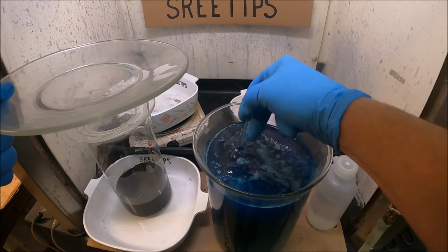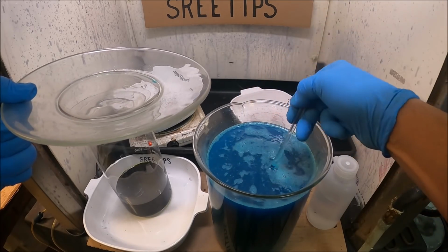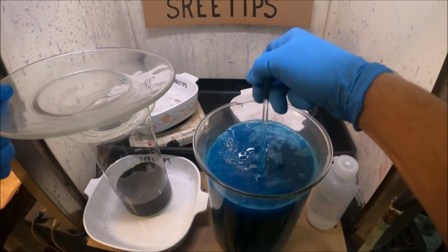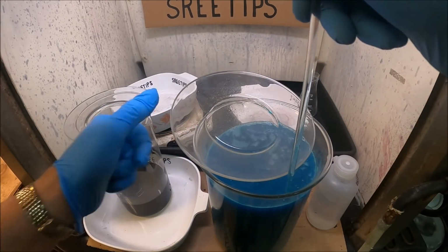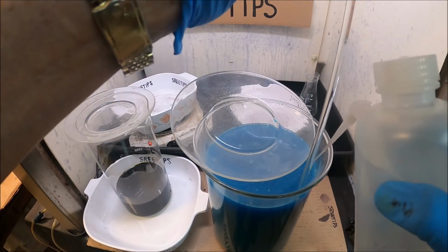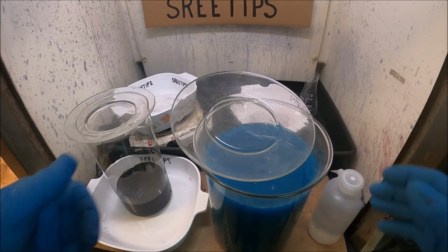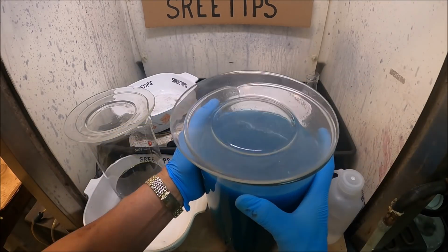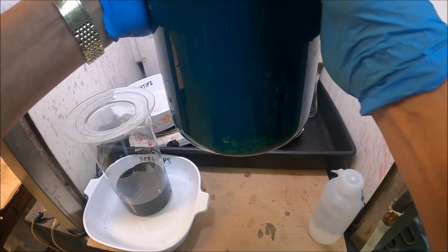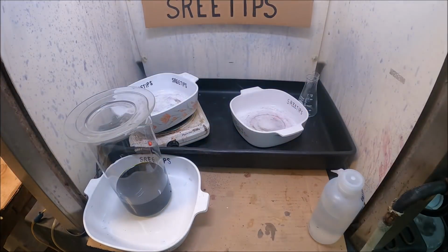And this has got a little bit more into it. The last solution that I filtered back in part three, there was a leftover solution in a filter flask, and I added it to this beaker to cement any metals out. And you can see here that there is a little bit of silver down the bottom. Now we're going to set this aside, get it out of the way.